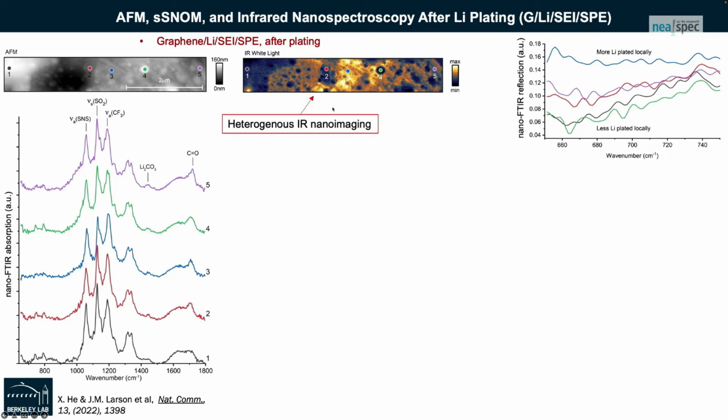And this is further supported by heterogeneities within suppressed absorption features. So let me draw your attention to just two traces, the blue and the green. These two correspond to 0.3, which has a lot of white light response, and the green, which has very little white light response.